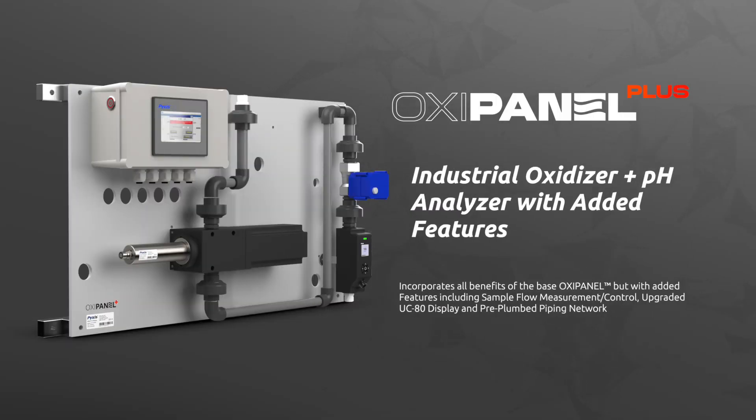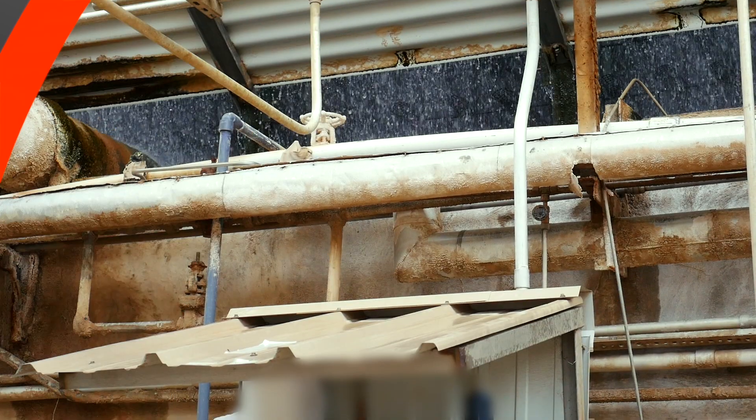Hey everyone, Jake Diak with Pixis Lab, and today we are super excited to announce the launch of our OxyPanel Plus IK765SS BP series of pre-mounted multi-parameter analyzers with some enhanced features like integrated flow control and an upgraded display and data logging terminal.